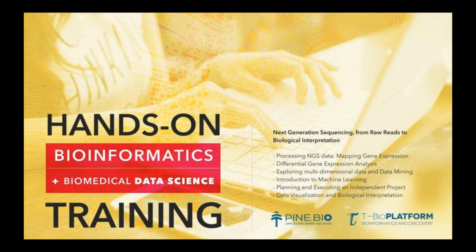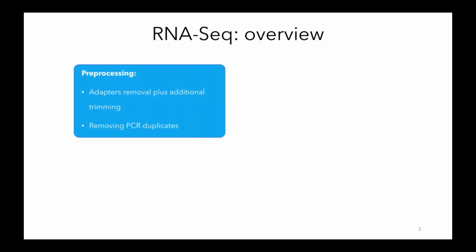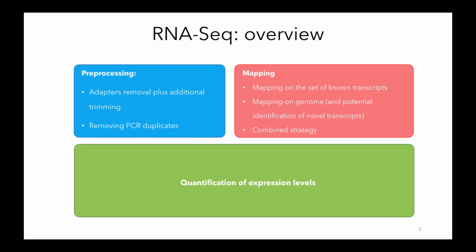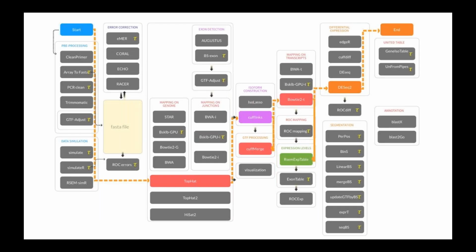Okay, so last time we talked about gene expression, and specifically the stages of RNA-seq being pre-processing, mapping, quantification, and then together we ran this differential gene expression pipeline.